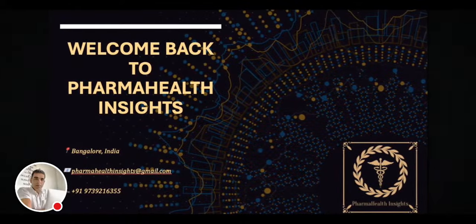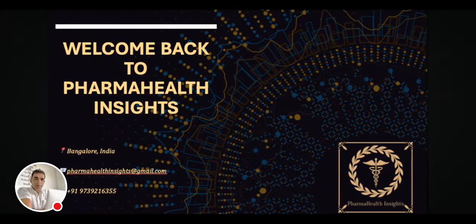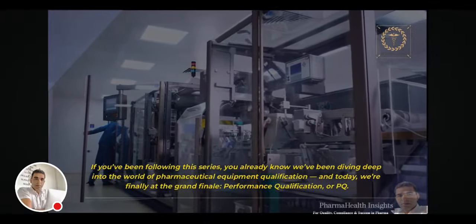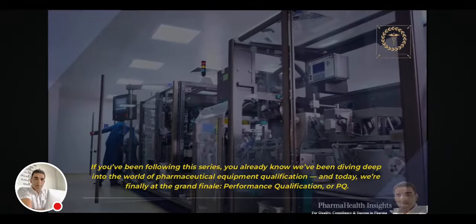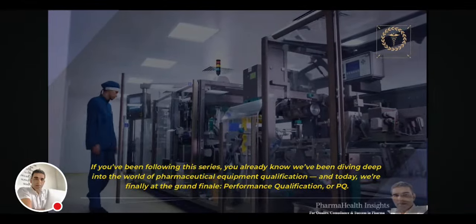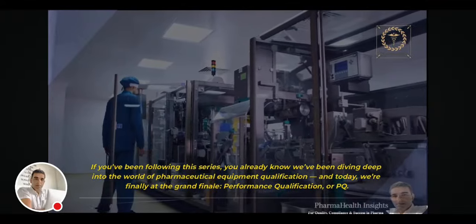Welcome back to Pharma Health Insights with Rajesh. If you've been following this series, you already know we've been diving deep into the world of pharmaceutical equipment qualification, and today, we're finally at the grand finale, performance qualification, or PQ.